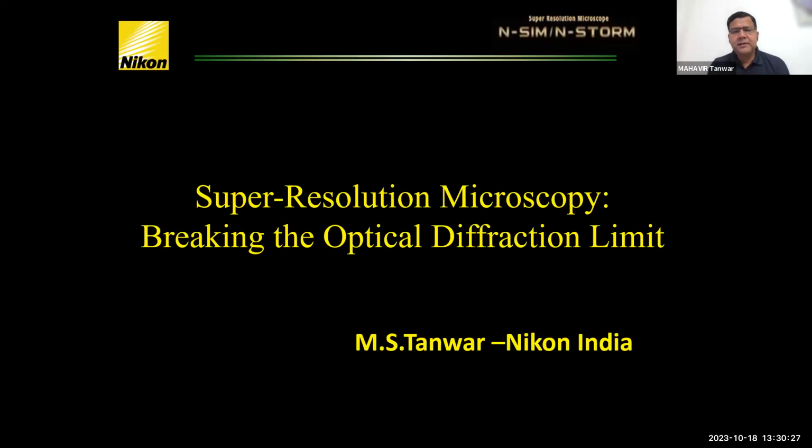Now, what is the optical diffraction limit? The optical diffraction limit is the capability of the optics wherein they cannot resolve better than some numbers. In case of optics, the optical diffraction limit is 240 nanometer in XY, and Z is around 550 to 600 nanometer. You cannot resolve better than that by just using an optical microscope. So you need some processes to improve the resolution. How we do it, I'll try to explain. This is very much physics, but just stop me wherever you want.